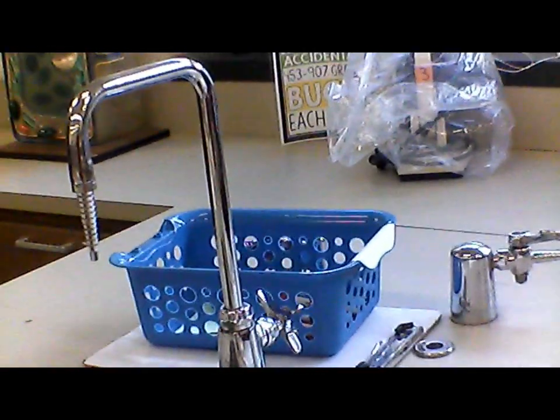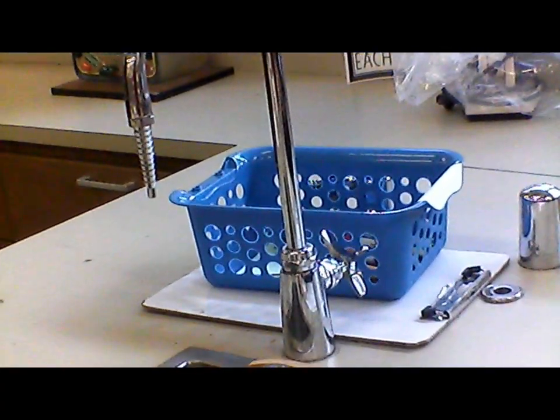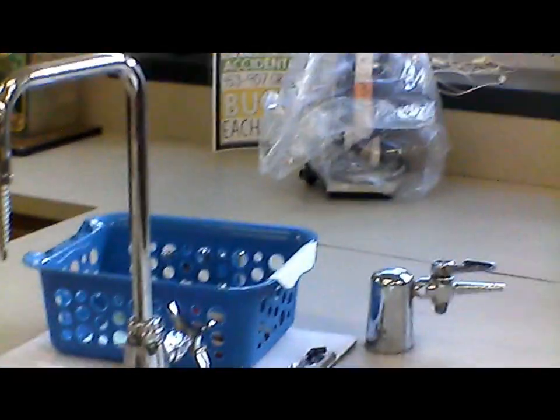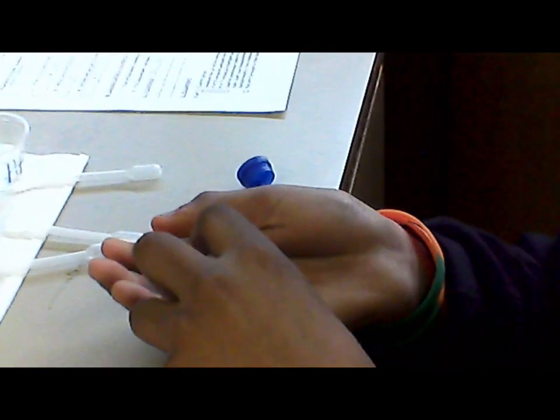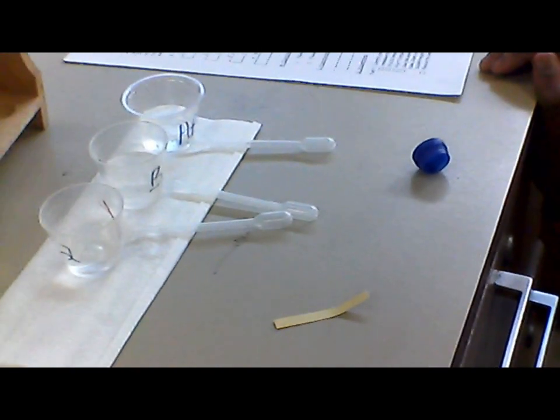Do we measure? We didn't measure the pH of the avocado yet. We're supposed to measure the pH of the avocado. Alright, how do we measure the pH? These strips. Alright, bet. We hit it with this? Yeah, I guess we could just put a drop on it or something. Alright, here we go.